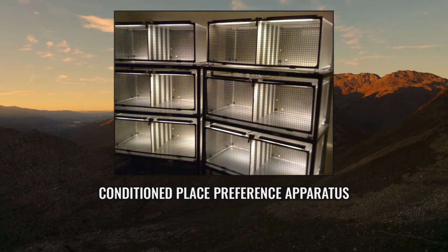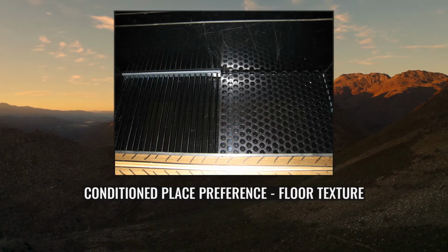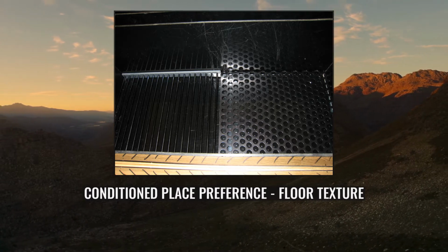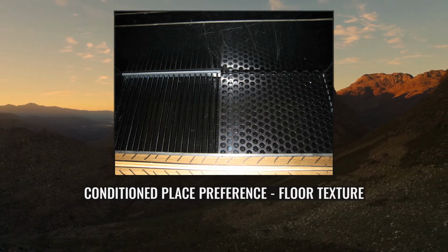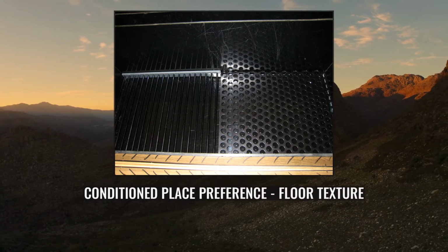Two different methods are used to choose the compartments to be conditioned, and these are biased vs. unbiased. The biased method allows the animal to explore the apparatus, and the compartment they least prefer is the one that the drug is administered in, and the one they most prefer is the one where the vehicle is injected. This method allows the animal to choose the compartment they get the drug and vehicle in comparison.